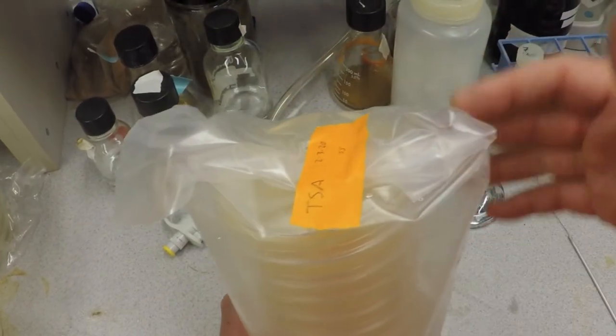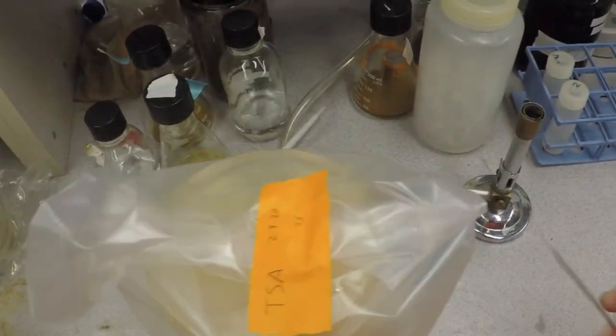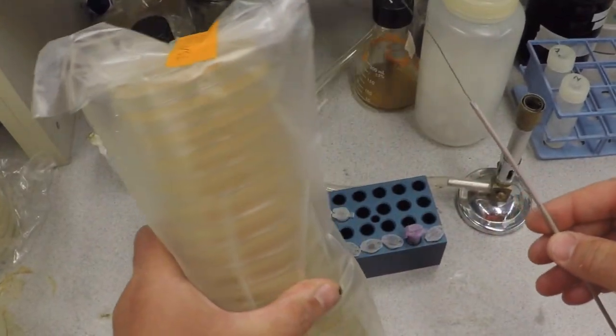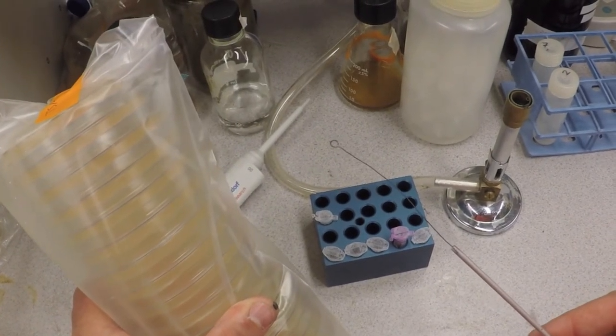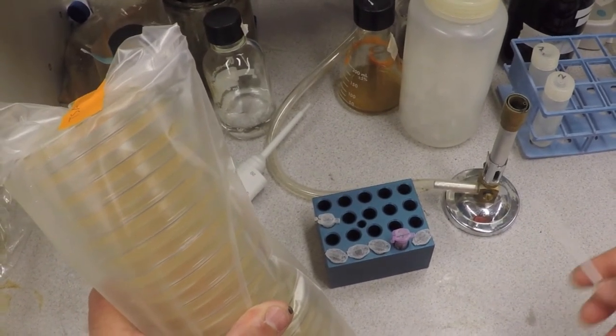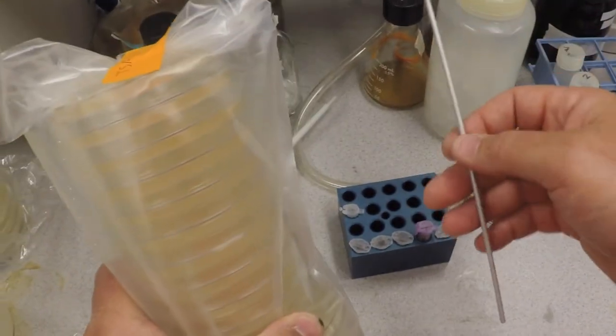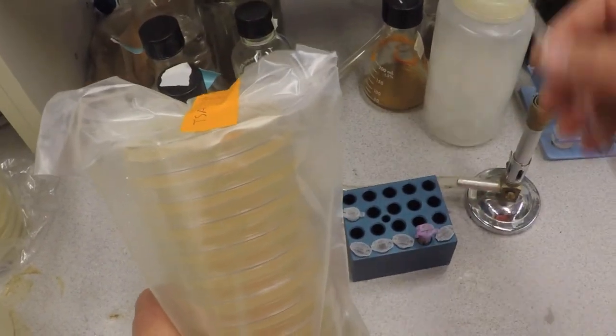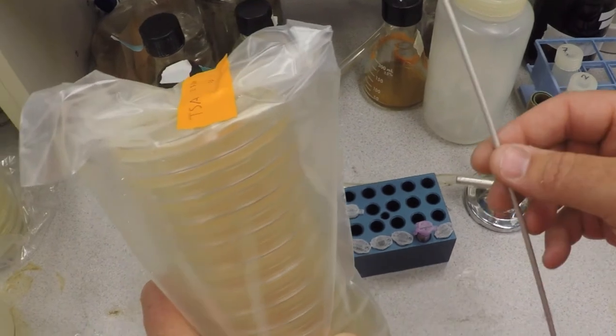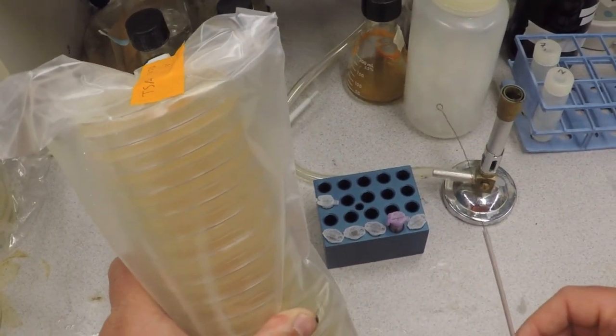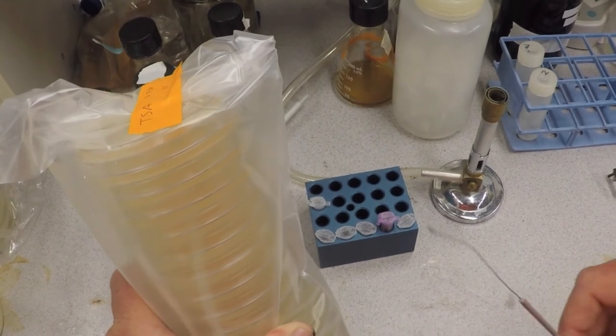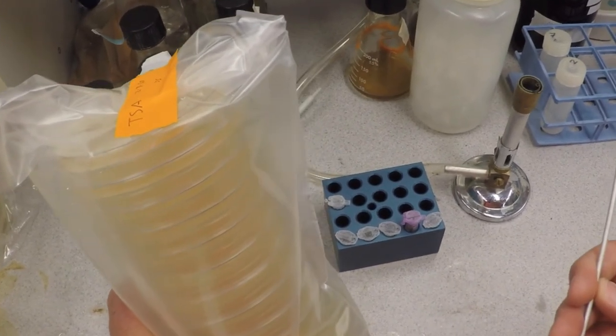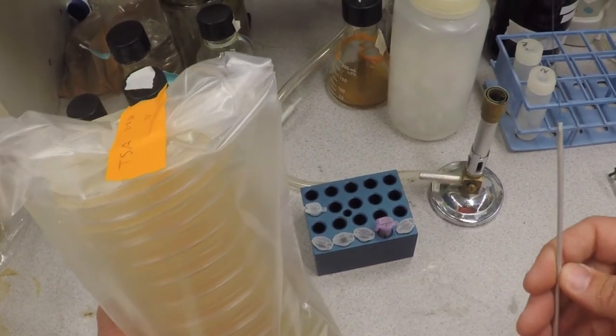We're going to be using what's called an inoculating loop, which is what this thing is. Can you see that little inoculating loop? If you accidentally touch something with this—you touch your hand, you touch the bench, you touch your phone—we're going to re-sterilize this. There's no reason to guess. You've got to just be aware of your surroundings, go relatively quickly, and know what you're going to do.